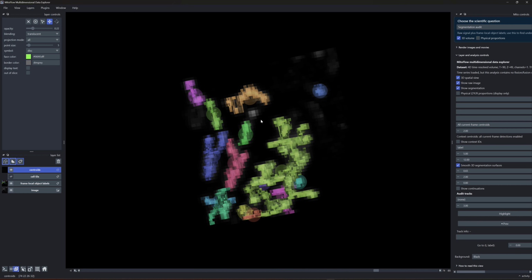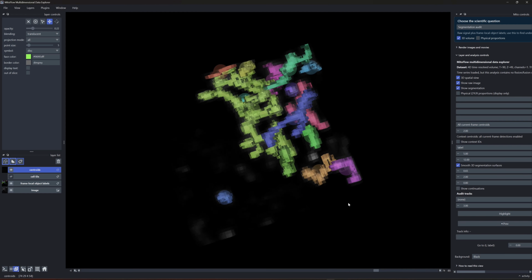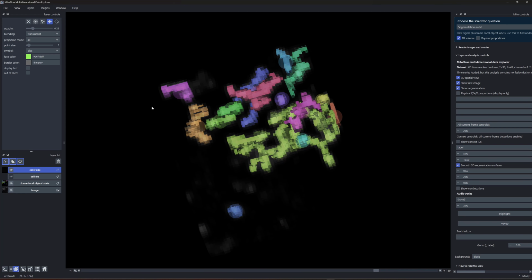So several years ago, I got fed up with the pipeline chaining that I was doing to be able to achieve mitochondria analysis. And I ended up developing what you're seeing in front of you. So in this video, I will show you the workflow that I use with MitoFlow to achieve a certain amount of analysis that I like to do for my images.